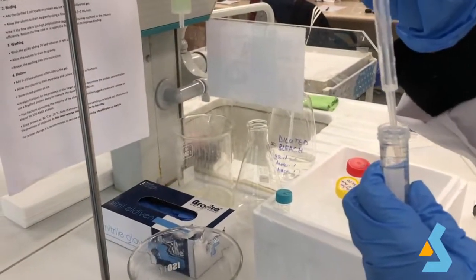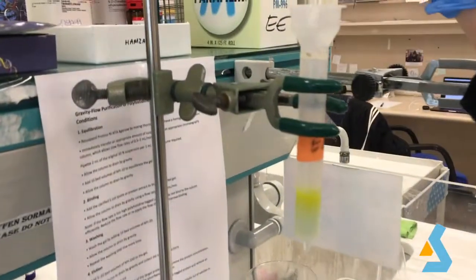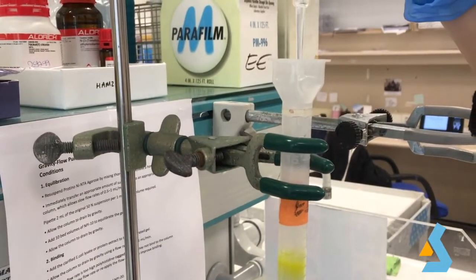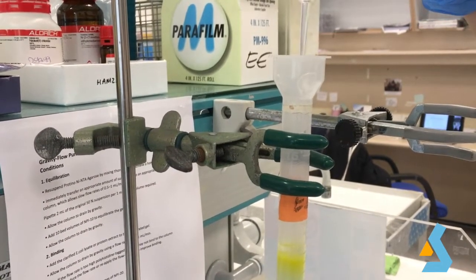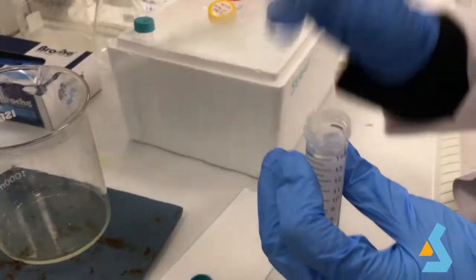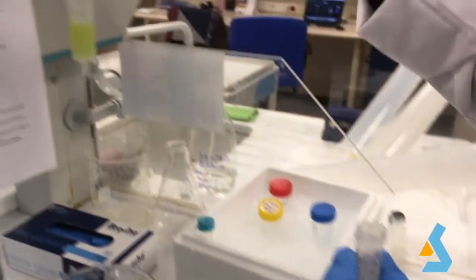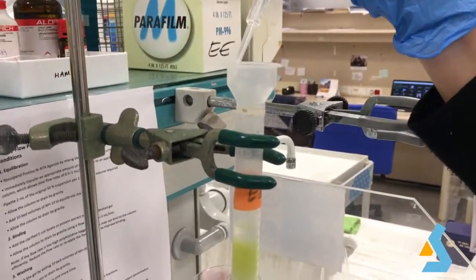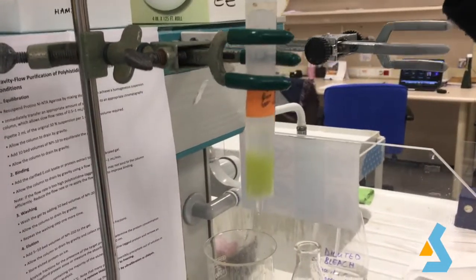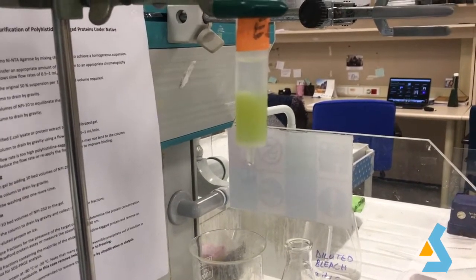Here, we use wash buffer to remove contaminants and other proteins to purify the His-tagged protein. Load the buffer to the column as gently as possible. After washing, we add elution buffer to unlink the resin and the protein. Since we were purifying a fluorescent protein, yellow color coming down could be a clear indication of protein elution.